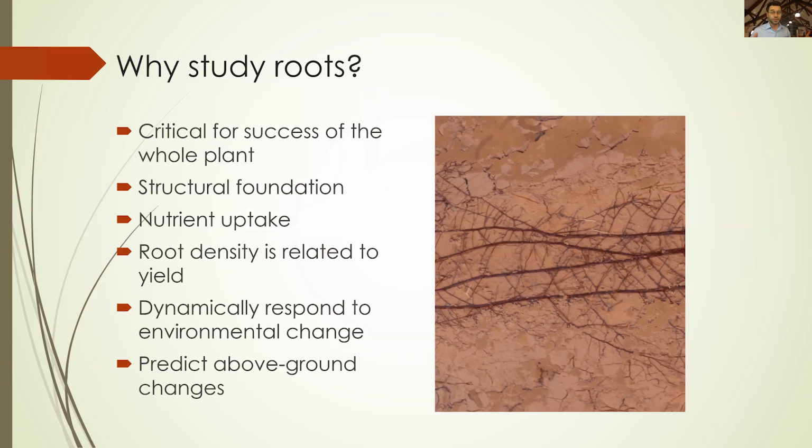But first, let's cover why we should study the roots. One, it's critical to the success of the whole plant. They are absolutely critical for understanding plant or crop yield, environmental effects, and the additions of certain chemicals and elements. Greater emphasis has been placed on root study, so instruments such as the mini rhizotrons are no longer simply in the domain of scientists, but are also being utilized by crop consultants, agricultural researchers, and farmers to understand the effectiveness of soil treatment, fertilizers, and other nutrient applications. They can be used for, say, measuring and planning for the impact of drought and temperature fluctuations, or monitoring for root pathogens and estimating crop yield. So root study is really just an integral portion of understanding the plant's health and production as a whole.